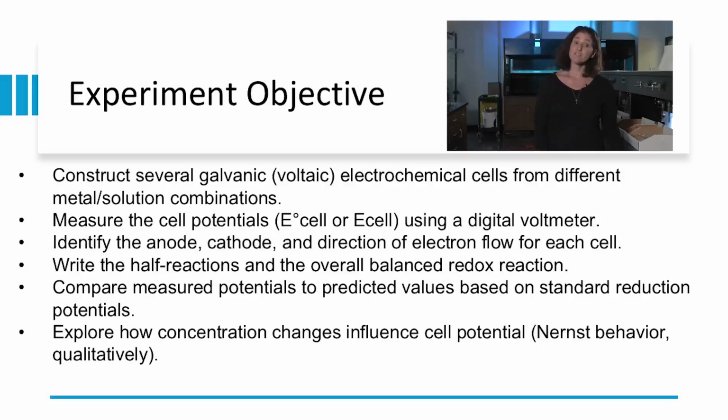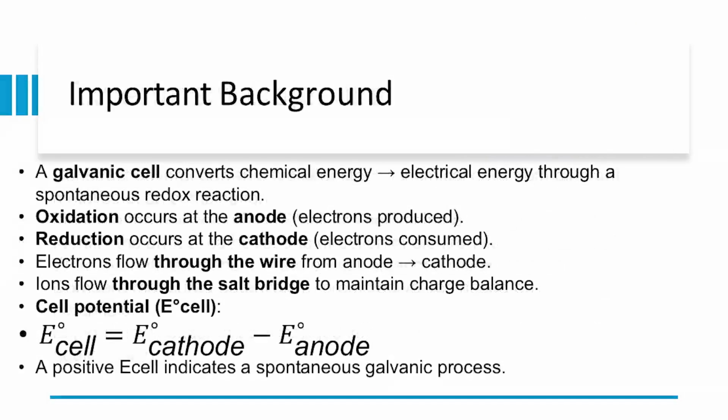We're going to compare the measured potentials from the experiment to predicted potentials using our standard reduction potentials. And then, if we have time, we're going to explore how concentration changes the cell potential utilizing our Nernst equation.